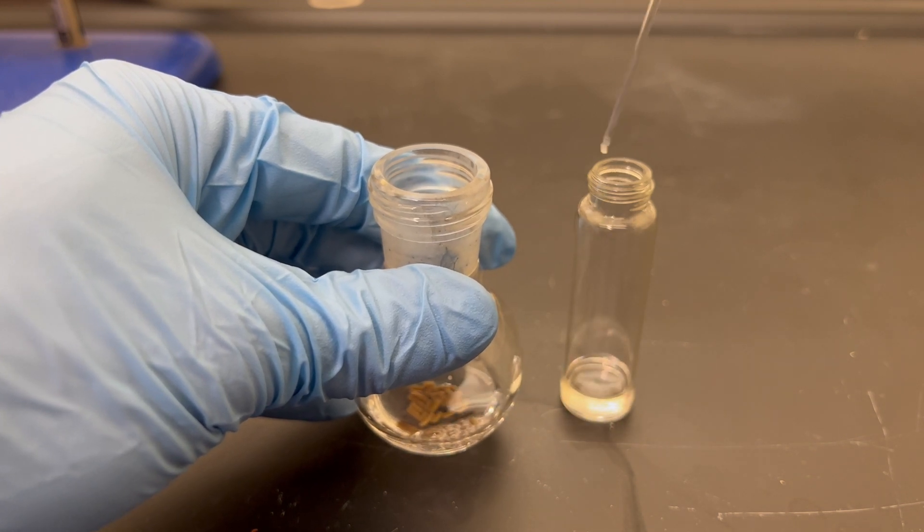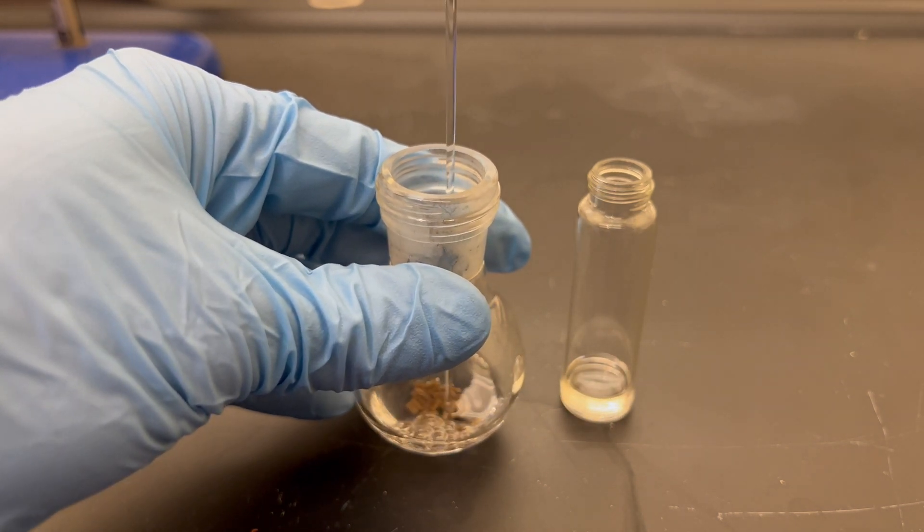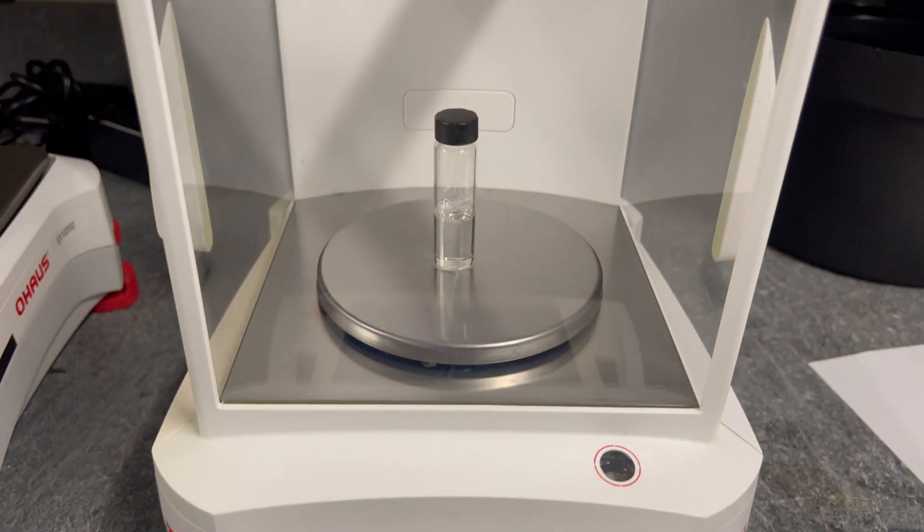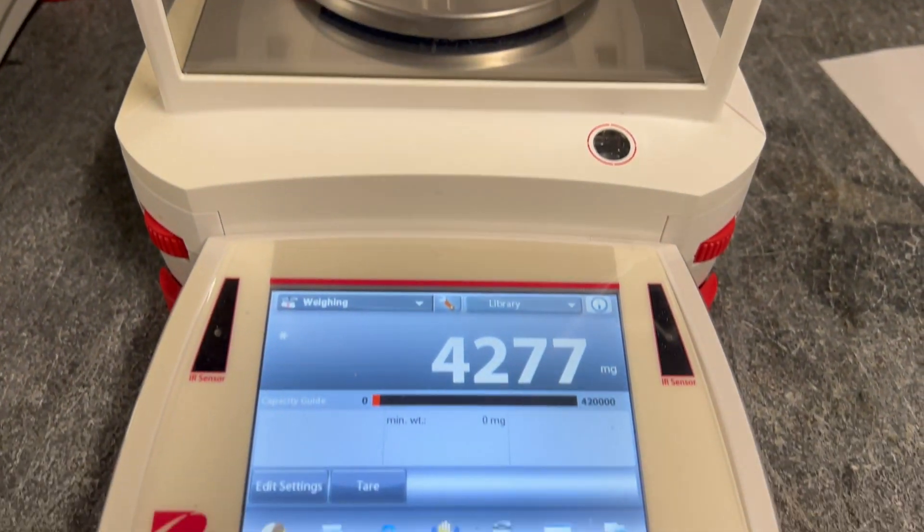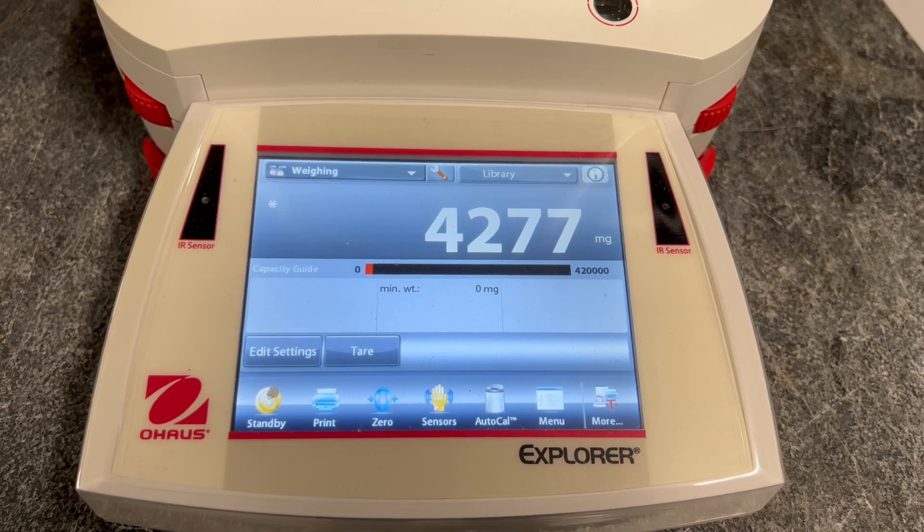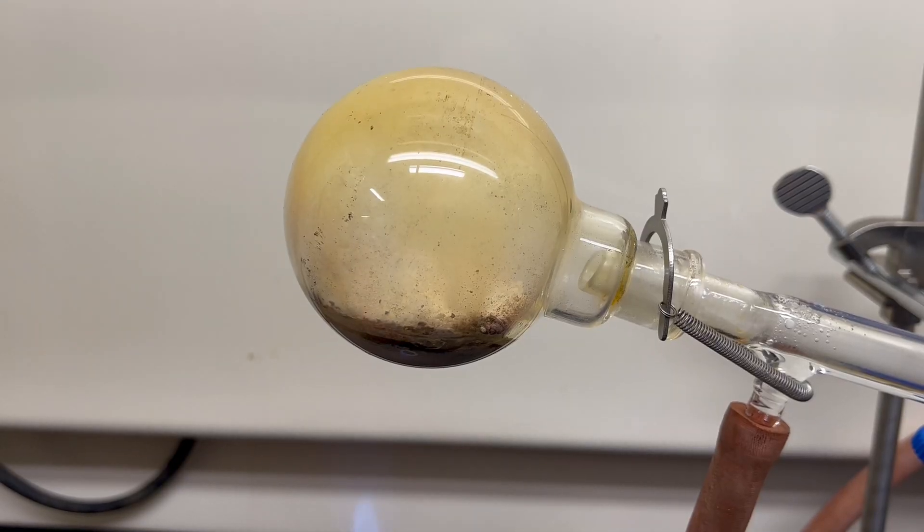The now-dry benzene is transferred to a tared vial. The yield is 4.277 grams, a 55% yield. Low yields such as this are common for this reaction style. It produces many byproducts instead of pure product.